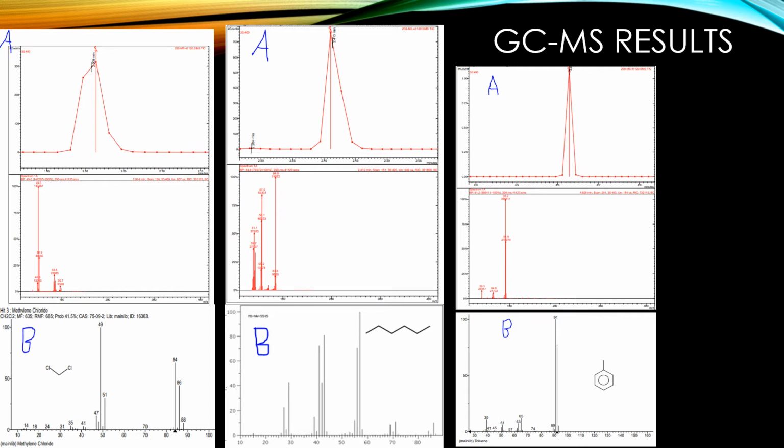The isotopic peak of chlorine was found at MZ values of 49, 51, 84, and 86. The 86 and 51 peaks represent one chlorine atom with 37 atomic mass units. The 84 and 49 peaks represent the carbon, atomic number 12, and the loss of the chlorine radical at 35 from the molecule, CH2Cl2, which is 84, making the CH2Cl+, which is 49. The loss of the chlorine isotope, which makes 37, from the dichloromethane.